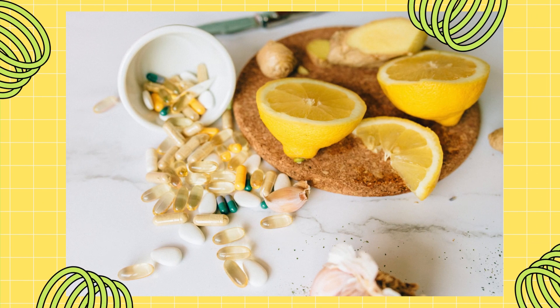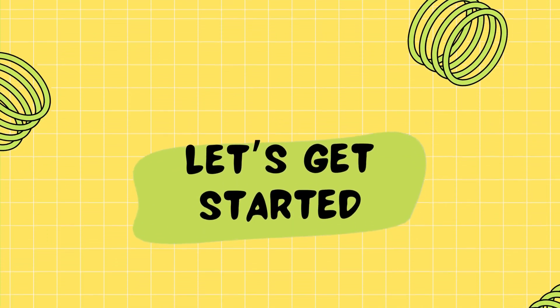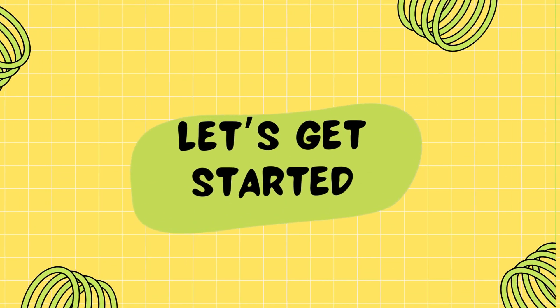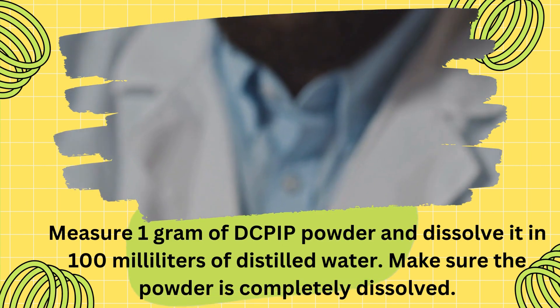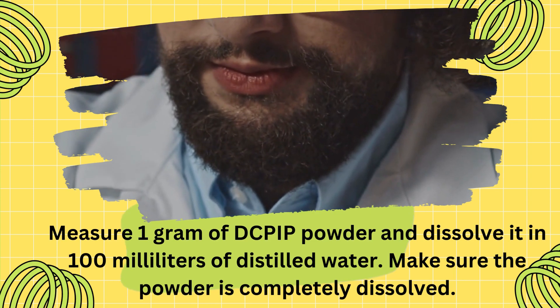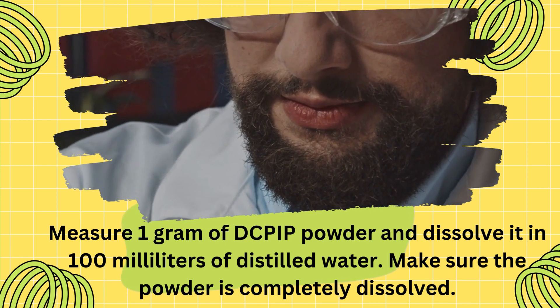And here we have some vitamin C tablets, the star of our experiment. To get started, let's create our DCPIP solution. Measure 1 gram of DCPIP powder and dissolve it in 100 milliliters of distilled water. Make sure the powder is completely dissolved.